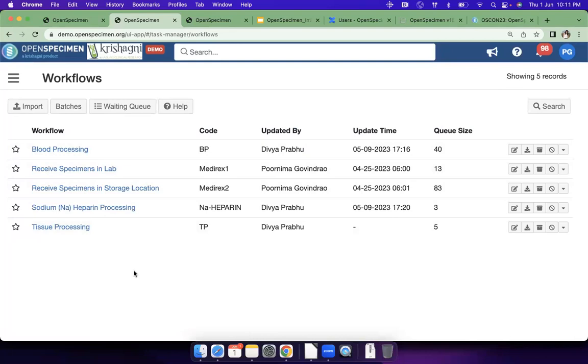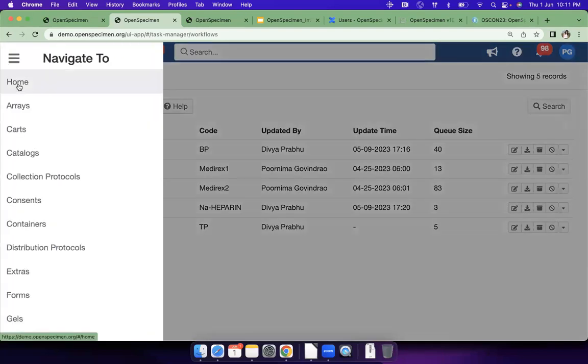It will save your data entry time because you don't have to do all these steps in multiple pages, with multiple clicks. And finally, you collect high quality data because you have every time point of what happened to the specimen, so that you will be able to do reporting based on that. So the workflows module will help you track that.